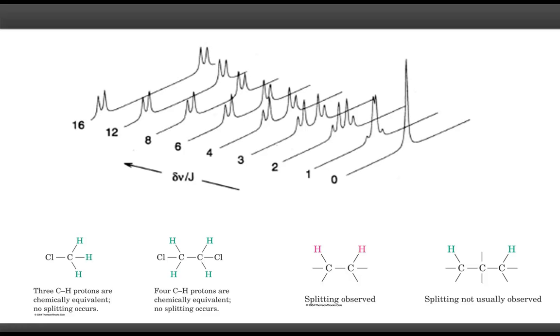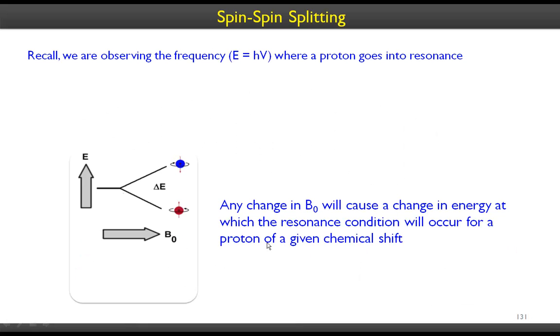dihedral angle. And the number of splittings, this is a quartet, and some are triplets, some are doublets in other peaks that we saw in the previous spectrum. That's caused by the number of magnetic nuclei that are on the adjacent carbons. So that's what we are going to learn today. Anyhow, let's look into the reasons and the orientations that we have been talking about, neighboring nuclei.